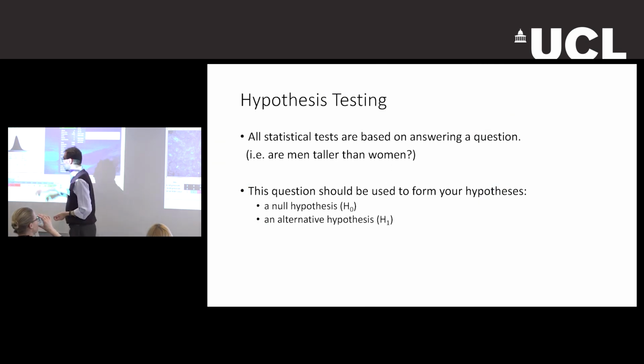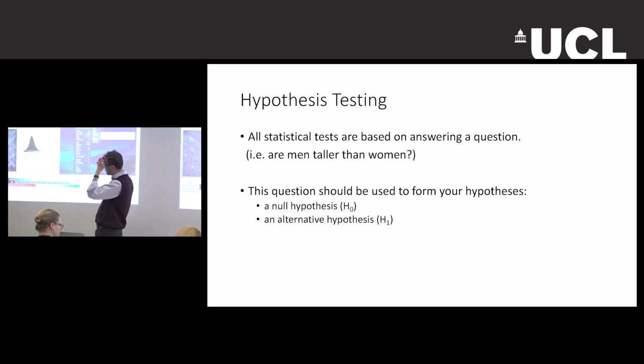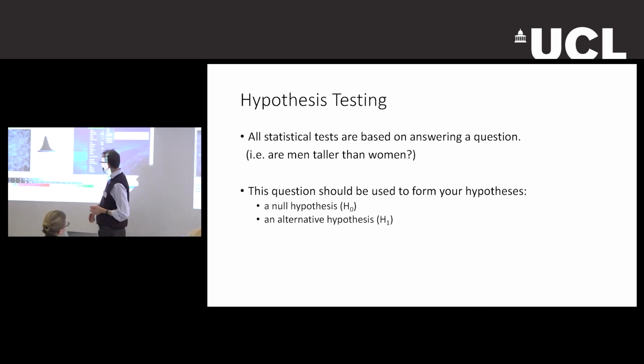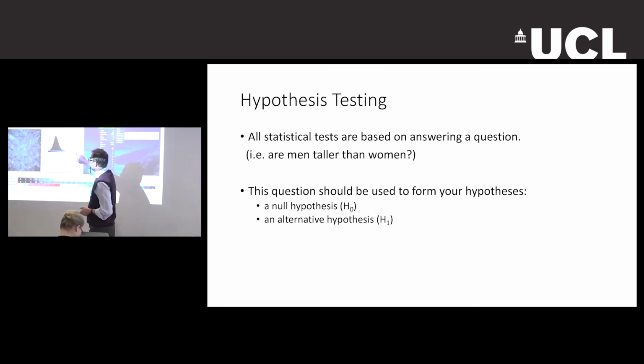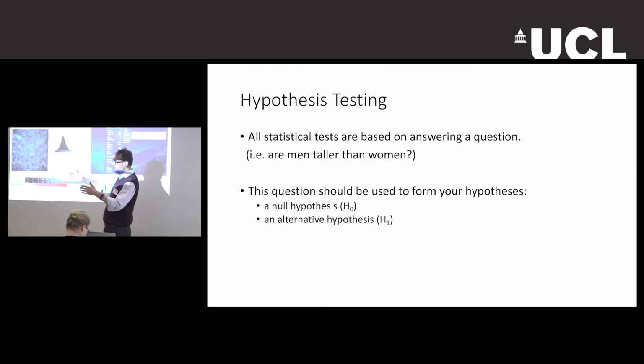The last thing of this panel, which is quite important to me, is the histogram. I will show you examples, but you see your gray levels here. This is a binning of all your image, so all these 2000 pixels, from the multiplication of these numbers, are binned in a single graph, and the height of the histogram represents how many pixels of that intensity value there are.